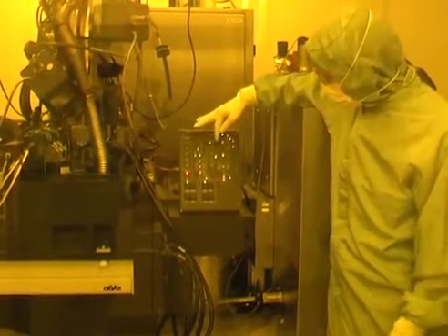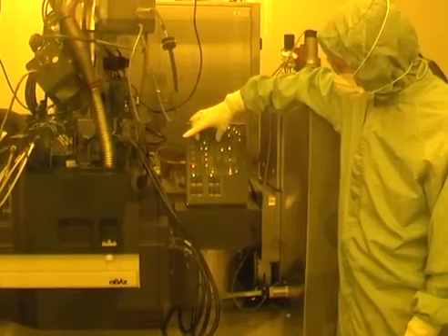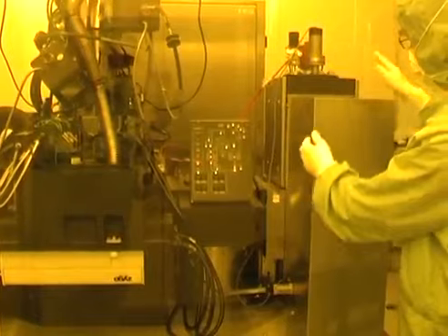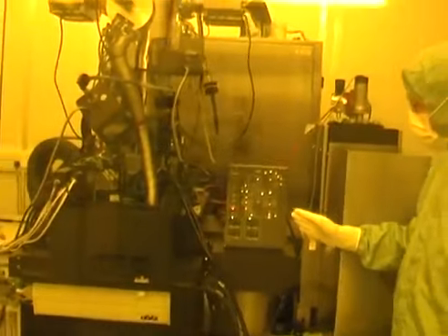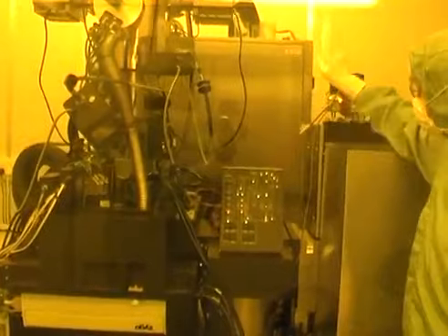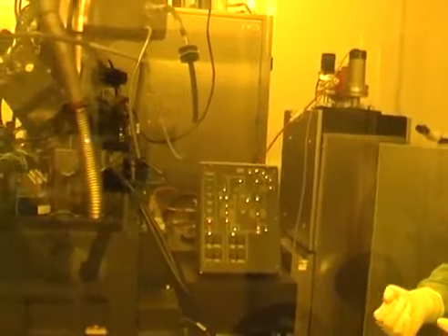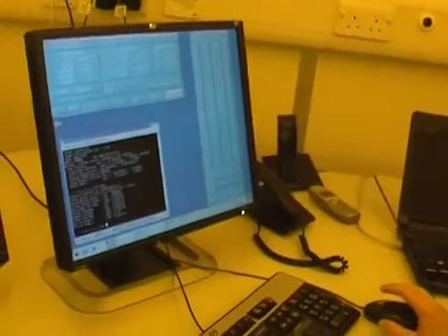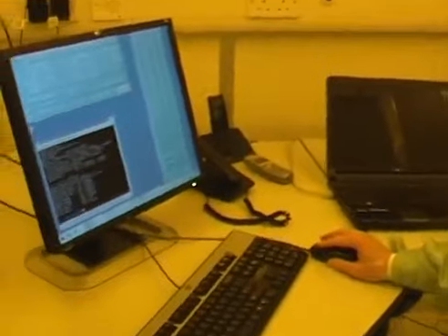One thing you'll notice about this whole display is it's back to front. It's got the airlock on this side and the column on this side, whereas in reality it's the other way around. The airlock's on this side and the column's over here. The reason for that is that normally this panel sits on the other side, across there, facing in that direction, but the way we've set the VB6 up here at Glasgow means we have it here and everything's round the wrong way.